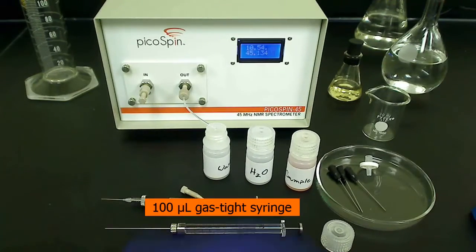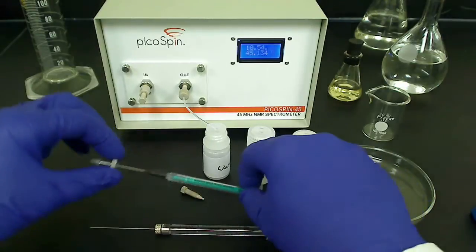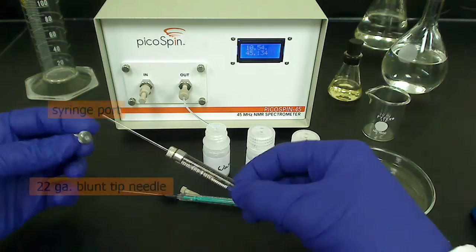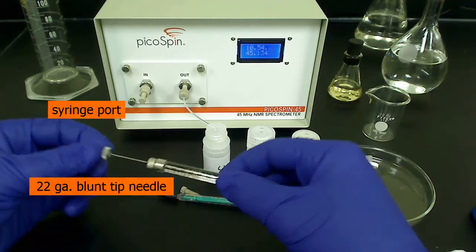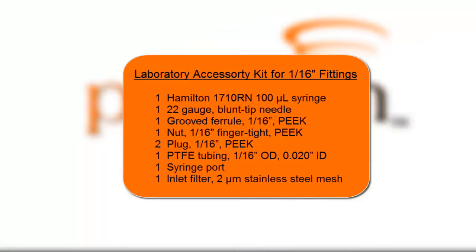You can follow the same procedure of sample injection using an HPLC gas-tight syringe. You would consider switching to a gas-tight syringe for analytical work, or when only a small volume of sample is available. I'm using a Hamilton 1710RN 100 microliter gas-tight syringe fitted with an inch and a half long, small hub, 22 gauge blunt tip needle. These parts can be found in the laboratory accessory kit.